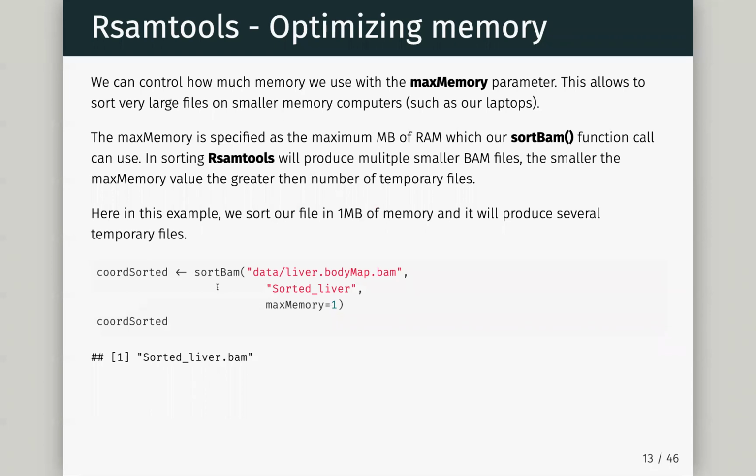So now practically, if you are going to use Rsamtools, you're not going to be able to run and sort your proper RNA-seq BAM files on your computer in a memory-friendly way. If you do, maybe you'll have a nice laptop like me, or you're working on the HPC, and that's possible. But if you are limited in any way by RAM, the way sorting BAM files actually works is very easily split.